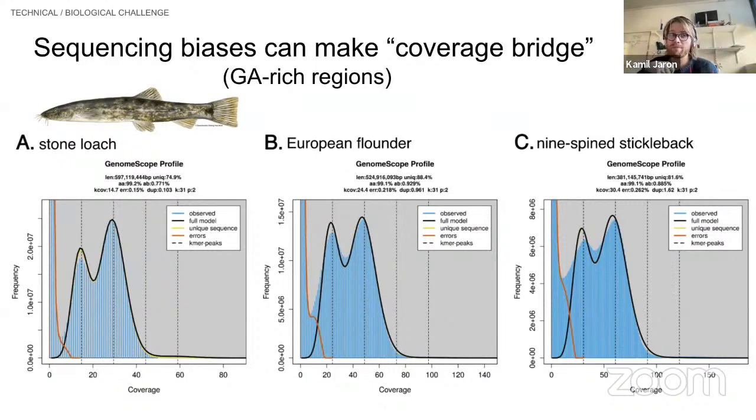In most genomes, it makes very little difference, and you could notice it on a big scale like a k-mer spectrum. But in many fishes, it's actually a fairly common repetition. So it depends on which fish you look at, it will be more or less of a problem. It will create this characteristic bridge in between the error k-mers and the genomic k-mers. It's simply the real genomic k-mers, but with a dropout. It makes things more complicated. There is absolutely nothing you can do about it, besides the fact that by looking at the spectra, you will know that it will be a problem. Okay?